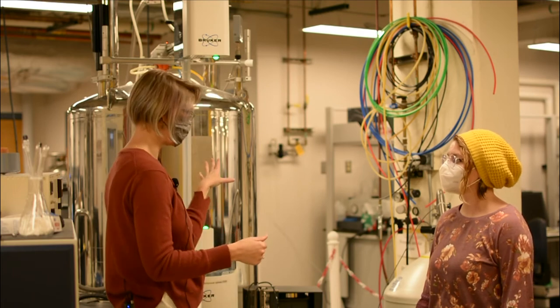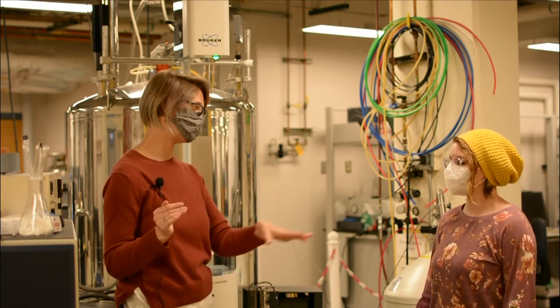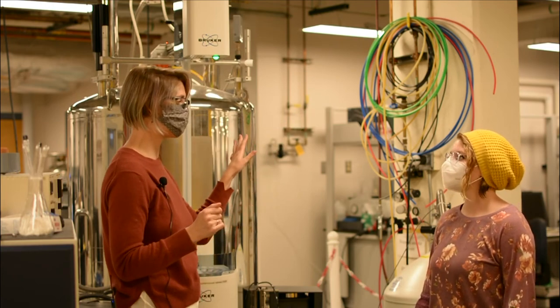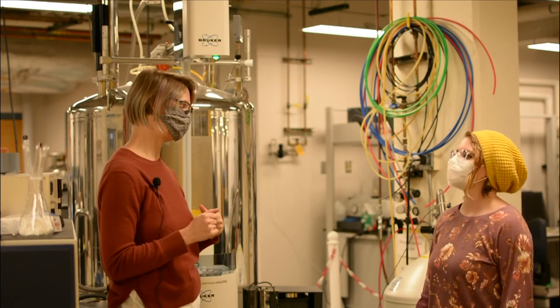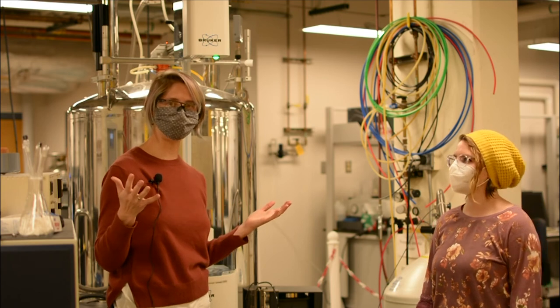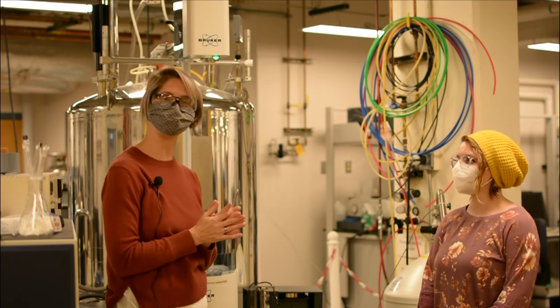If you see a quench — meaning vapor spewing violently out of the top of the magnet and nobody is standing next to it with a liquid nitrogen tank filling the magnet — you want to leave the lab immediately. Get low to the ground, let the people around you know that you think the magnet is quenching, and they need to exit the laboratory to stay safe. Now that we know how to keep ourselves safe and keep the magnet safe, we're ready to do some NMR.